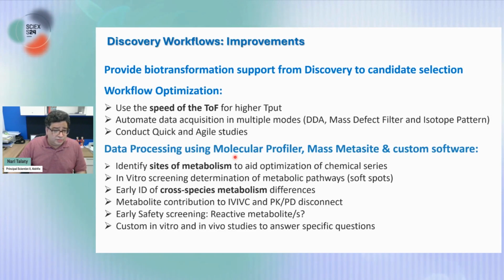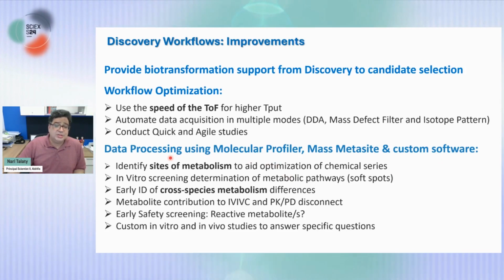So this is our workflow. On the backend, we also want to do a lot of work on software modification, right? So we want to take our molecular profiler, and we want to take MassMetaSite as well as our custom home-built software, and we want to do a lot of different things with it. We are working very closely with our colleagues at SciEx to do a lot of different assays using these software platforms.